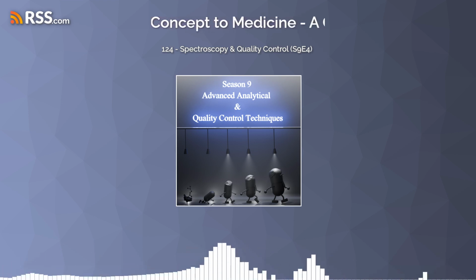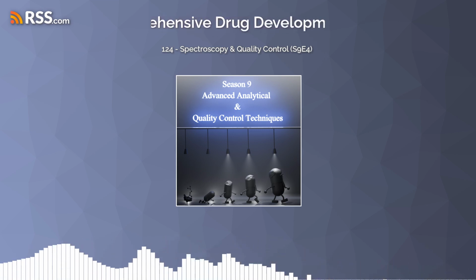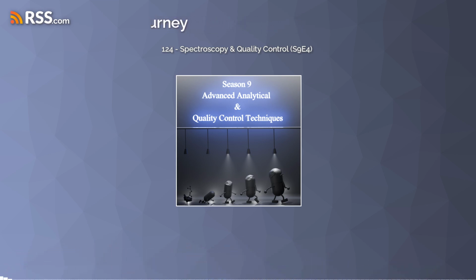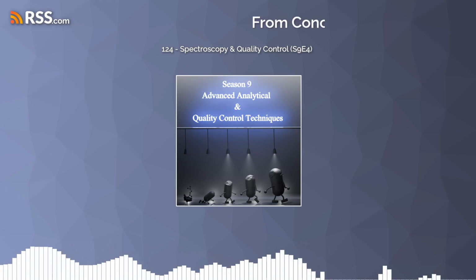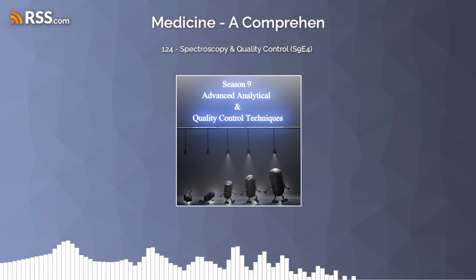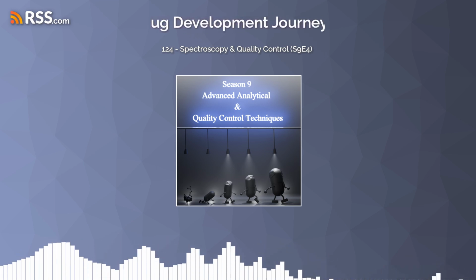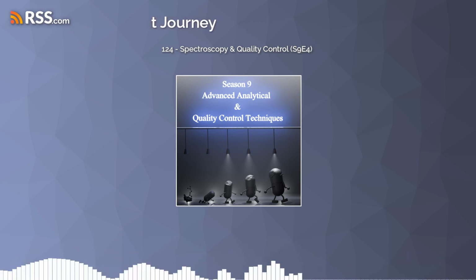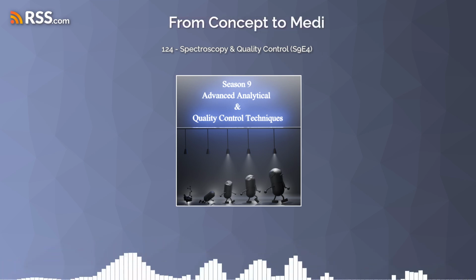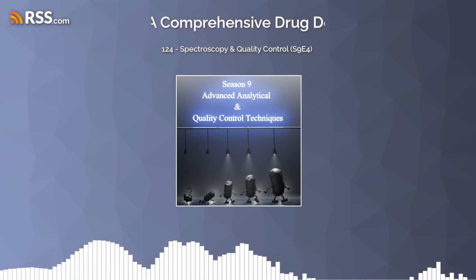And didn't you mention something about it being used in manufacturing? Yes. Raman actually has really great potential for in-process monitoring. What that means is you can use it while you're making a drug. For example, Raman spectroscopy can be used to monitor blend uniformity. So in continuous manufacturing, you're making a tablet, mixing up all these powders, the active ingredient with other things, and you want to make sure that it's all mixed evenly. Absolutely. So Raman can be used to check that in real time. And if something goes wrong, if it's not homogeneous, it can trigger an alarm, and you can adjust the process right away.